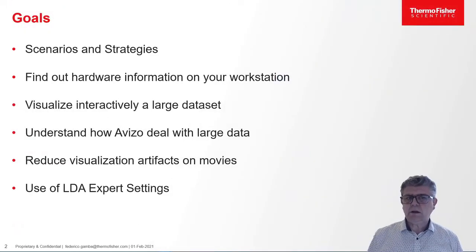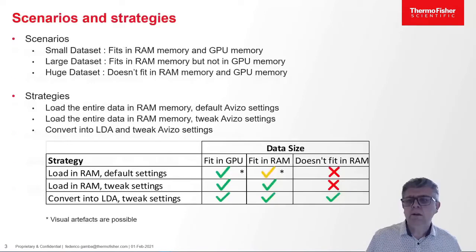So this is my goals and my agenda actually, is to show you different scenarios and different strategies according to the hardware of your workstation. We're going to speak mainly about visualization of large data and to make movies, and at the end we're going to use some expert settings to solve some more complicated situations.